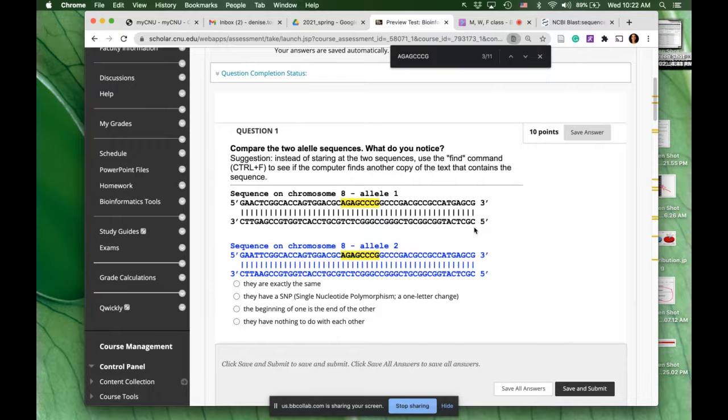So when we're sequencing a DNA fragment, we get a read from one strand and then a read from the other strand. And if you compare them directly, as in you would get A, G, whatever, and then you would get C, G, G, it doesn't seem like they're the same DNA sequence, but they actually are. They come from the same fragment.